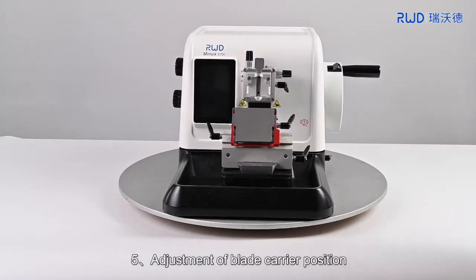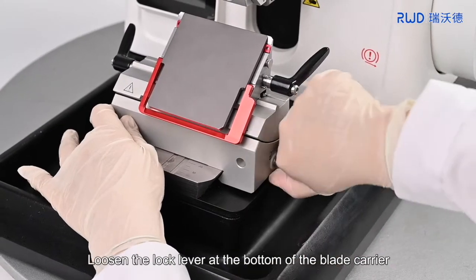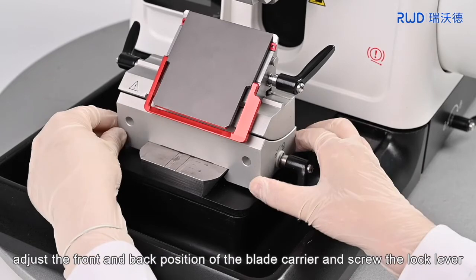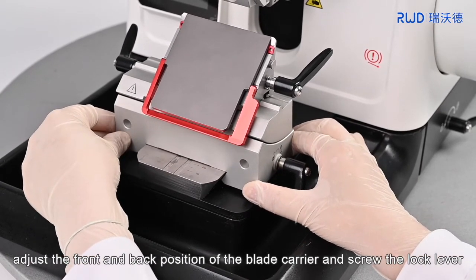5. Adjustment of blade carrier position. Loosen the lock lever at the bottom of the blade carrier. Adjust the front and back position of the blade carrier and screw the lock lever.